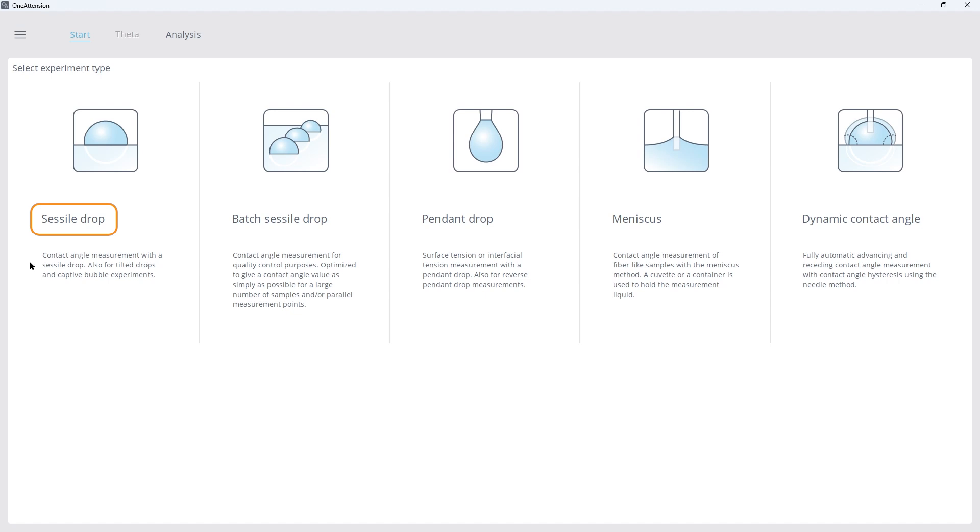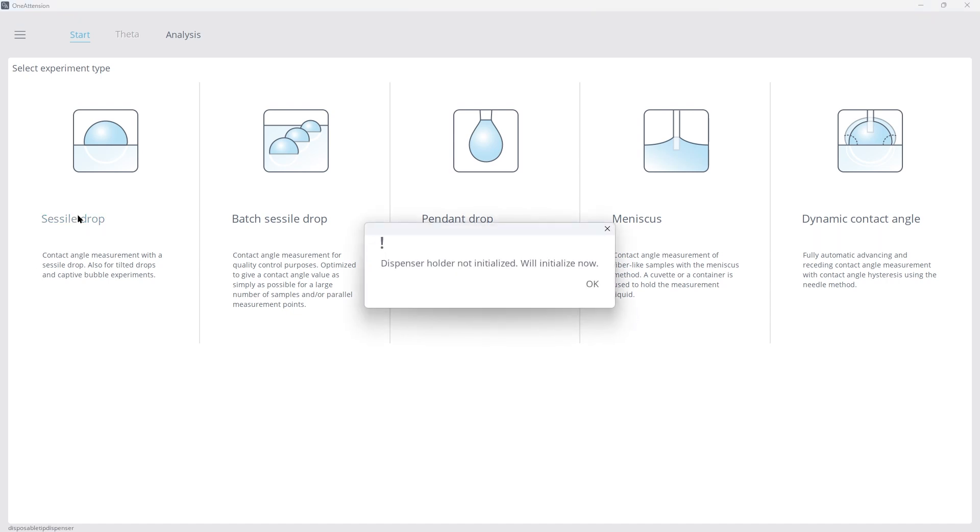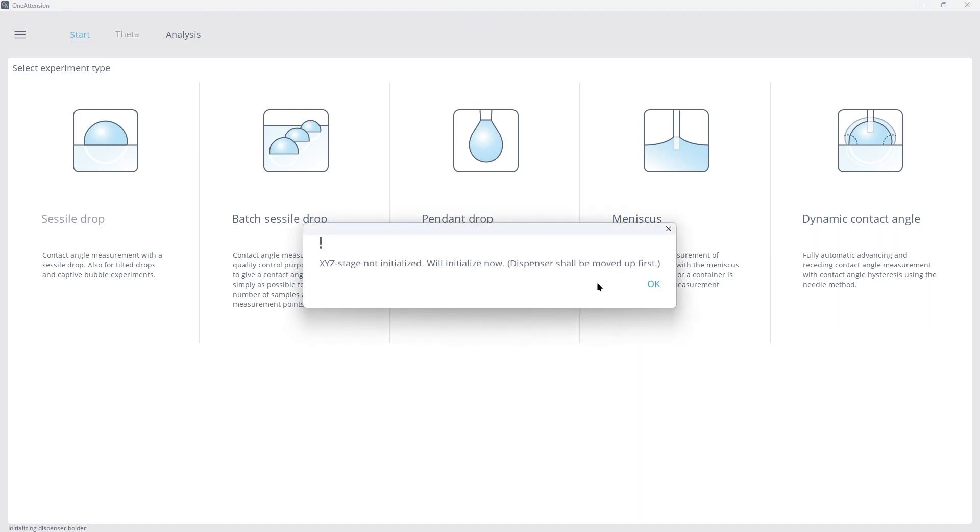Let's start by selecting the Cecil Drop measurement mode. You'll see a brief initialization process that prepares the dispenser holder and stage.